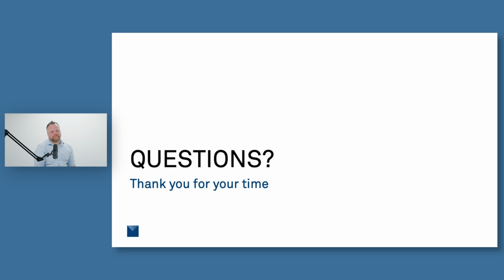All right, so looking at our questions today, our first one here, they're asking about the measurement time, and if there's ways that they can speed up that measurement time so they're not having to take measurements over the matter of a week or so. Yeah, that's a great question. We actually get this question quite a bit because it does take some time.